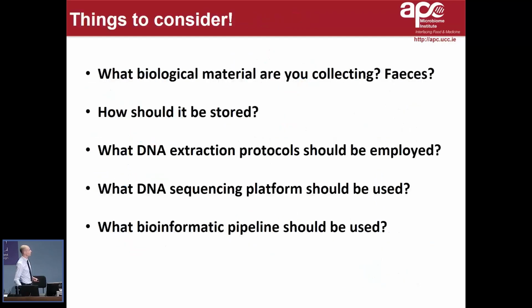So some other things to consider. What biological material are you collecting? Are you focusing on fecal material or some material from elsewhere in the intestine? How should it be stored? What DNA extraction protocols should be employed? What DNA sequencing platforms should be used? And what bioinformatic pipelines should be used? And all of these are of key importance.